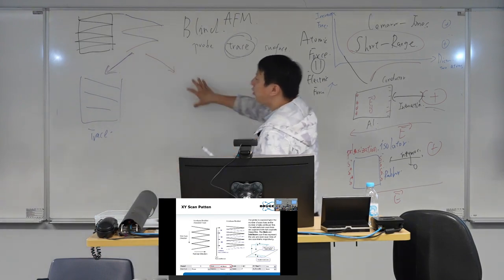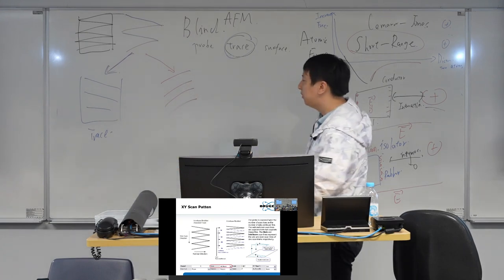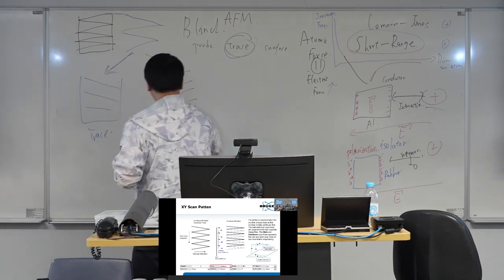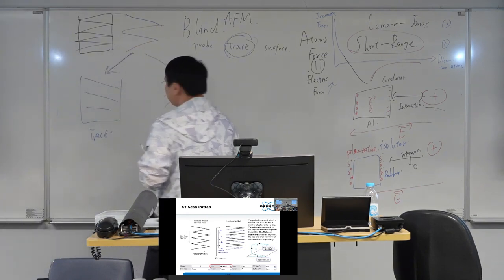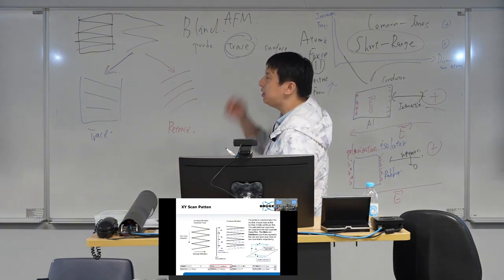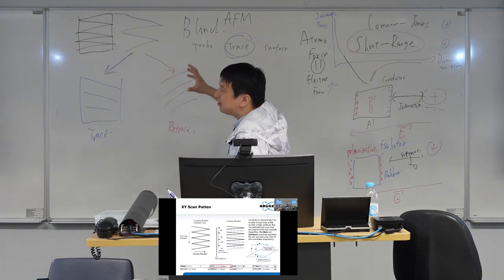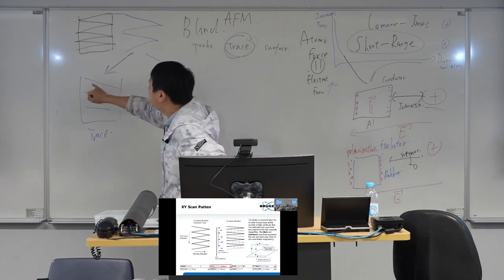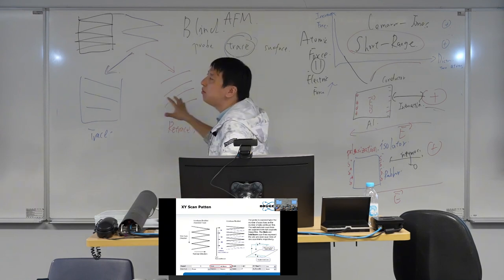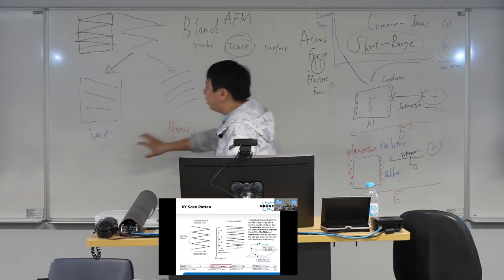And then all the retrace lines form a frame, and in the software, you will see it's retrace. So every time you will get two frames, any one you like. Basically, in our AFM, there will be a slight difference between these two frames, because the trace and the retrace are not completely the same, but it's almost the same. So in our software, you can choose any one of them.